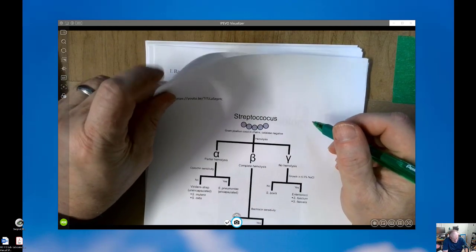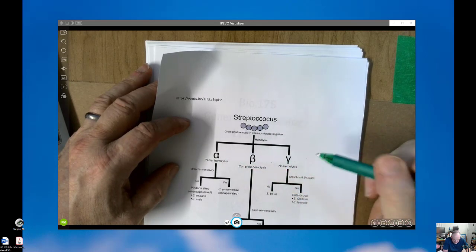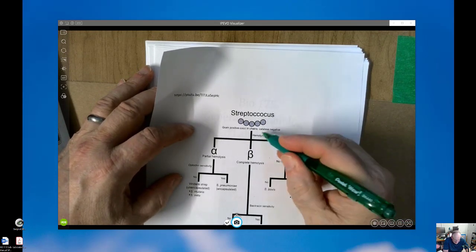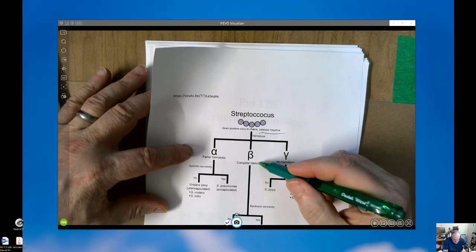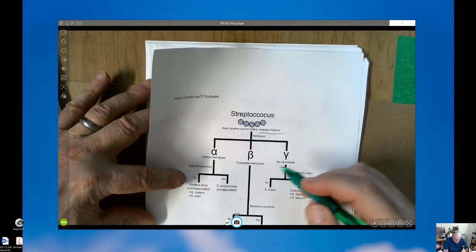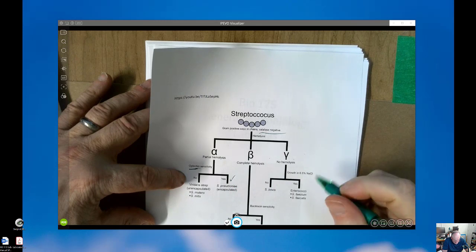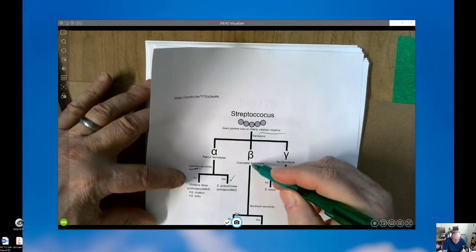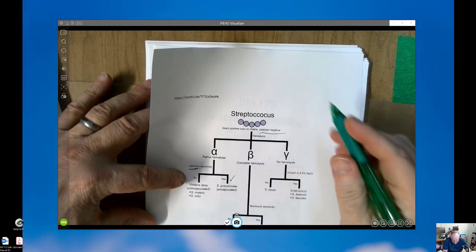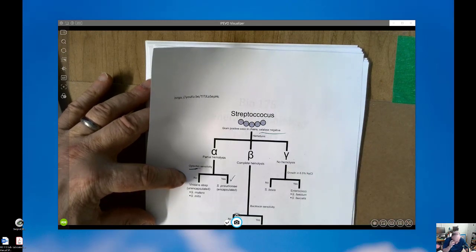The strep, very same thing, identifying based on hemolysis is usually what a diagnostic lab will use, in addition to the fact that it's catalase negative. The partial, complete, or no hemolysis, which is alpha, beta, and gamma. Optochin, if it's sensitive, yes, it's Streptococcus pneumoniae. If it has beta or what I call bad hemolysis, you can see the confluent area zones around where the red blood cells have lysed.